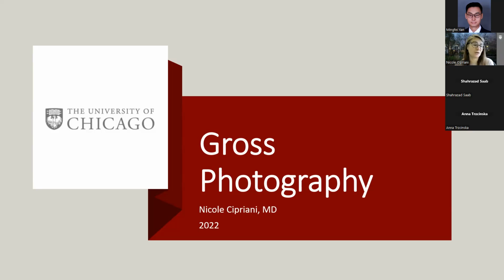And that, of course, doesn't go for only squamous cell carcinomas, but really for any neoplastic specimen, any rare specimen, any interesting cases, I would just say photograph liberally. And you can always delete, but you can't go back and retake once something's been cut or fixed or whatever, right? So that's my perspective.